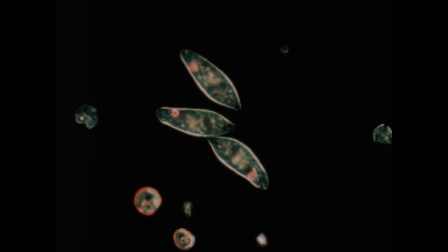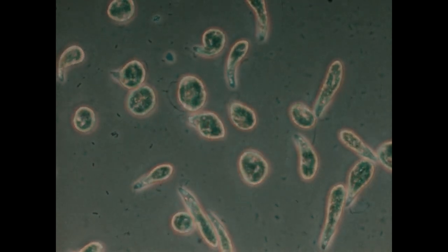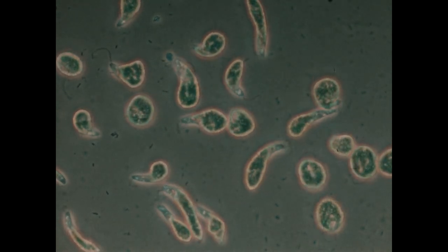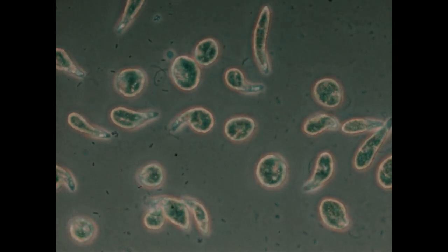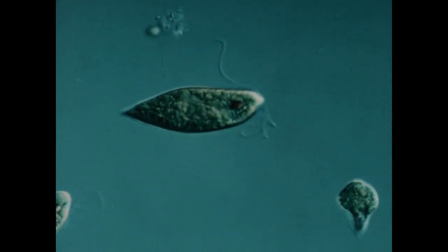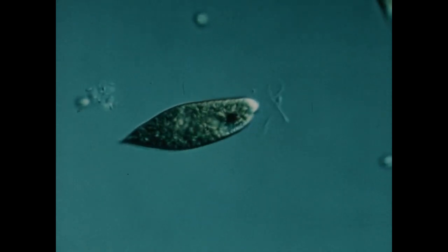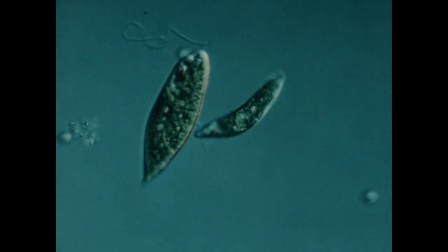For example, consider euglena, a primitive one-celled organism. Under normal bright field lighting, euglena's green chloroplasts and red eye spots show up. Dark field emphasizes euglena's cell wall. Phase contrast shows the whip-like flagellum, an important structure often difficult to see in normal bright field. Differential interference gives a different impression of the flagellum and shows further details of the cell. These techniques complement each other. No one method of lighting tells the whole story.